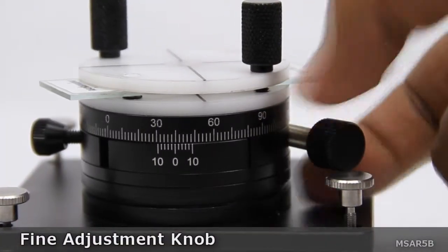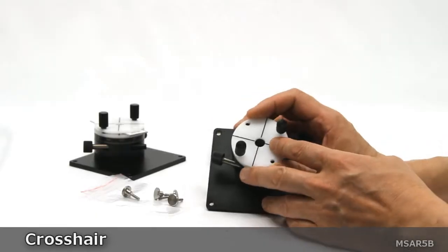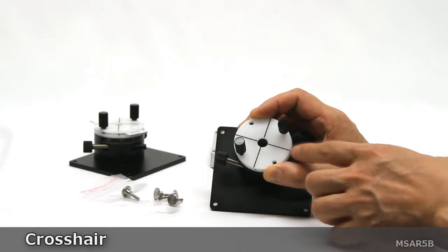Features such as a fine adjustment knob help users to perform precision movement, as well as a visible crosshair to help align and notate the position of the slide being used.